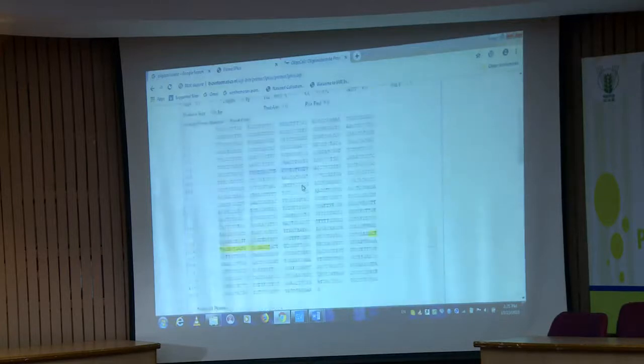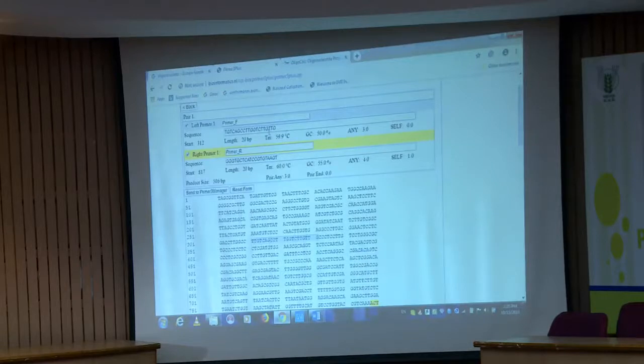So, you just take this, copy it down somewhere in some Word or Excel format, just to keep track of what all are the sequences from a particular gene. This is your forward one and this one is your reverse one. Now, it has given you the size, whatever range you mentioned, 500 to 600 bases. It has mentioned that the PCR is 506 base pair. The size of your PCR amplicon will be 506 base pair. Any confusion up to now? Any confusion? Yes?